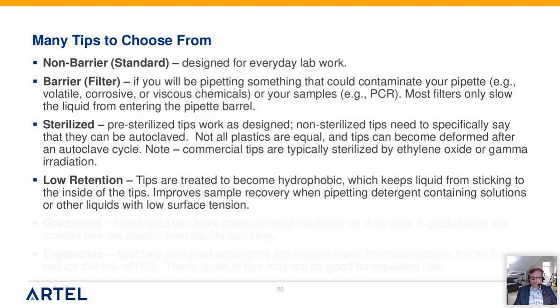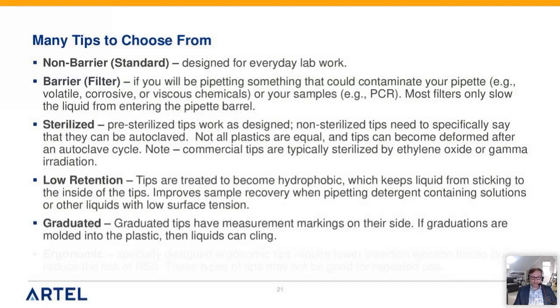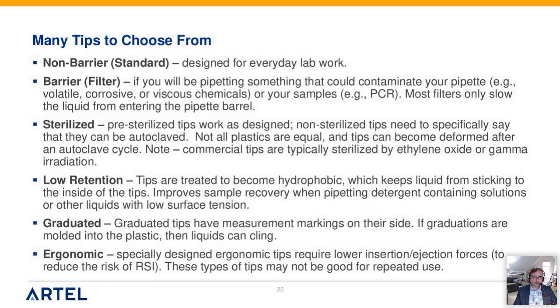Some tips are low retention by design. They're treated to become hydrophobic, so that's going to have an impact. So those aren't interchangeable with the above there, the non-barrier standard tips. They do have a difference in behavior. So keep that in mind. Graduated tips, they have little markings, and what that can do is afford places for liquids to cling. And when liquids cling, you form little droplets, and then sometimes you can over dispense unbeknownst to you.